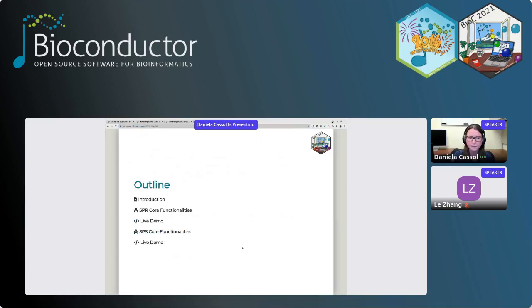Okay, next. So today our presentation will include a short overview of the main framework of the package and all the core features of the packages, systemPipeR and systemPipeShiny. And I'll introduce the central concepts for building and running the workflows with our packages. After that, we'll have the hands-on session with the live demonstrations.